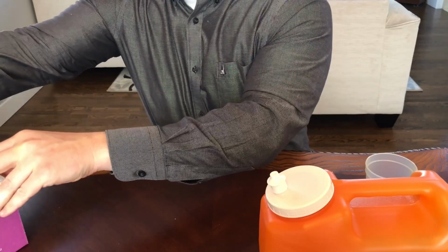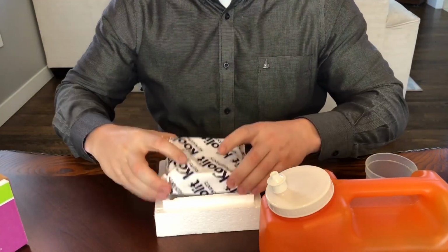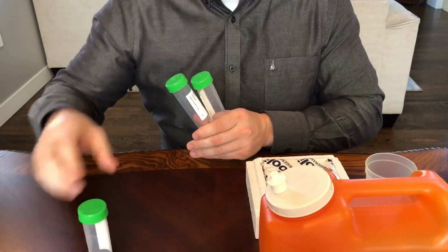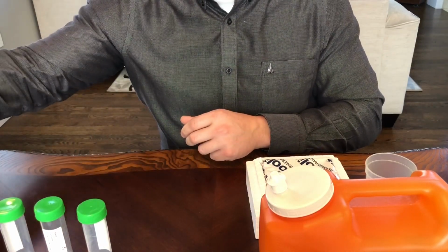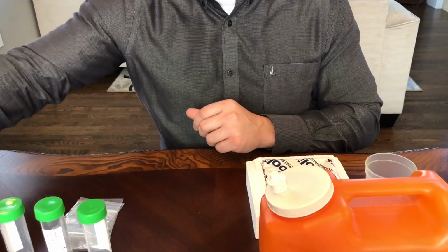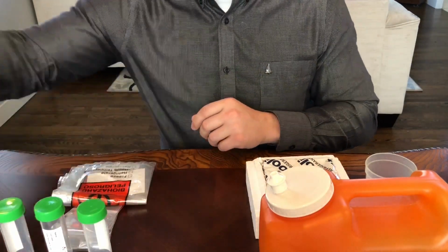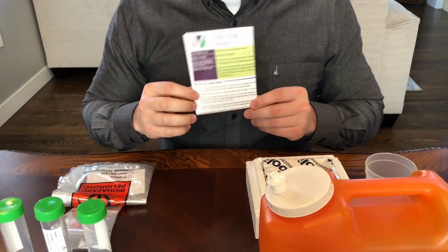In the kit, you should have one ice pack, 3 clear vials, 3 Ziploc bags, 3 biohazard bags, and 1 requisition and questionnaire.